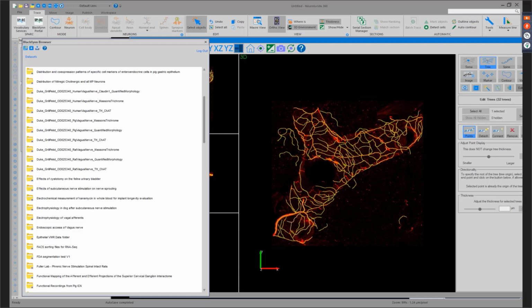Yes. Antonina wants to know if it's possible to segment a nerve cross-section image and extract contours or labeled images. The answer is absolutely. There is an automated tool that was demonstrated, but we have a couple of other automated methods as well to outline cross-sections and areas of high contrast, which are normally present with these cross-section images that you're talking about.